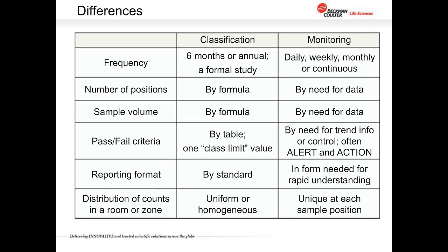Whereas when you look at the monitoring side, you're really dealing with something that is done more frequently, and you're trying to understand the current health, you might say, of the area. Is it still appropriate for the use? In that way, there's no formula for that. It's mainly a matter of looking at the data that is needed to understand that level of concentration of particles. Same with the sample volume. It's really defined by the need for information, the sense of risk, perhaps.